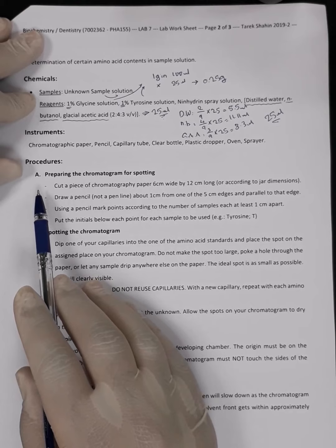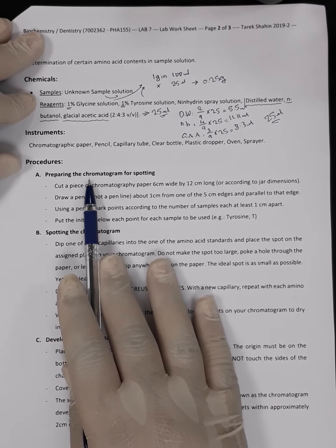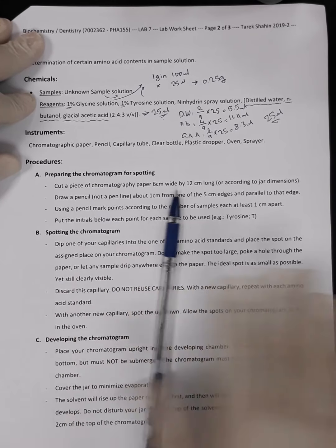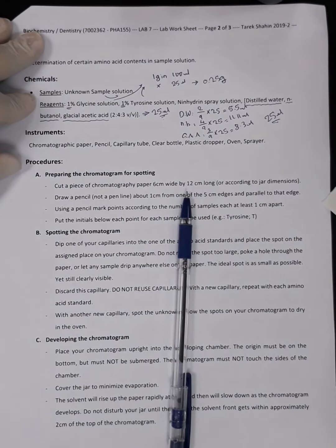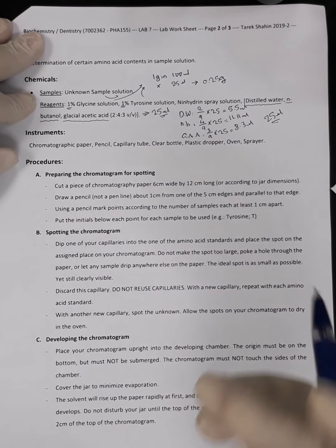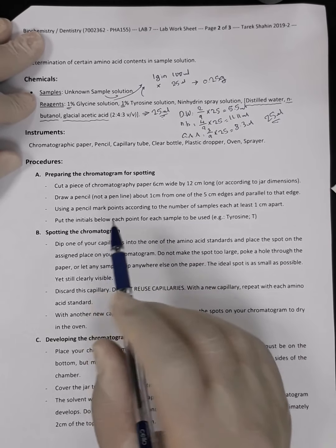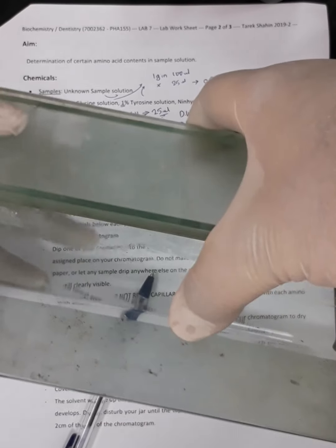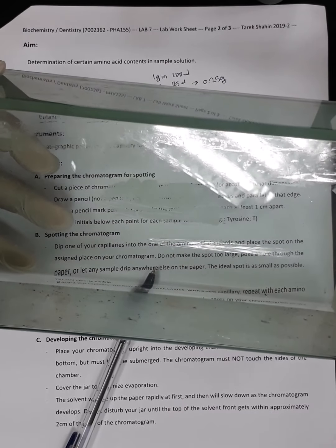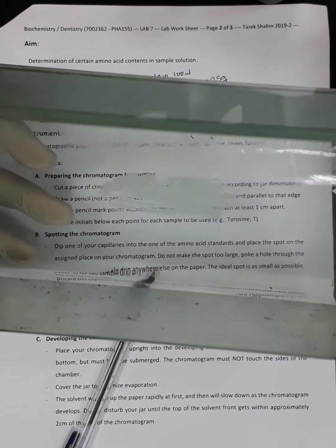Now we are going to proceed with further preparation: preparation of the chromatogram. When we say chromatogram, it means the paper itself. This chromatogram is made up of cellulose, as we said. So the width and the height of the paper will be totally dependent on the experiment itself. We said we are going to use the chromatographic tank or chromatographic jar. This chromatographic jar has a certain height. So we are going to measure that height with the ruler and we find out that it is 11 centimeter.